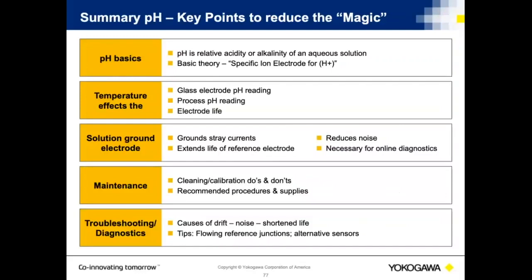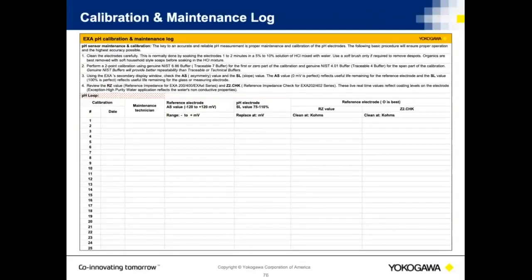Last couple of things here, you guys. If there are any questions, inside of most, or at any rate inside of the Yokogawa series of analyzers, there are internal calibrations and maintenance logs. I would suggest that you utilize those, and I would really stress learning how to use them, because they tell you a lot about things.